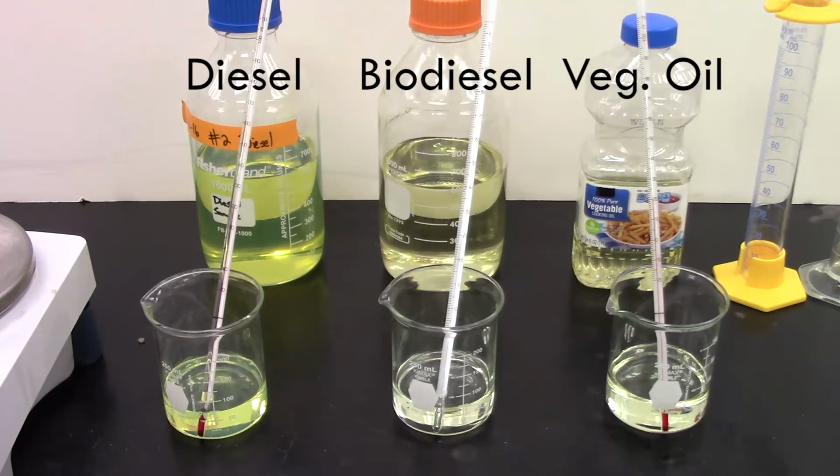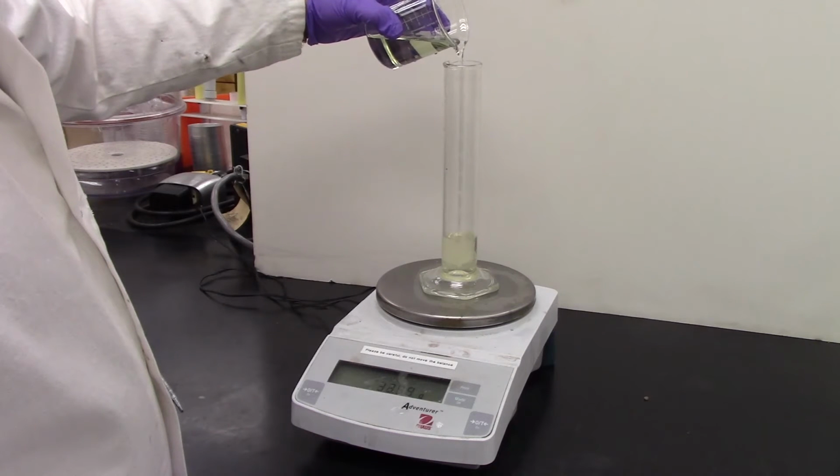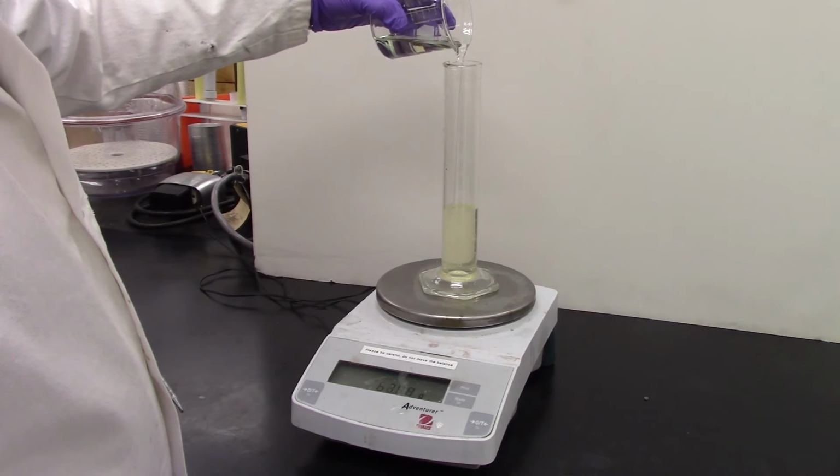Now, take the temperatures of soybean oil, biodiesel, and petroleum diesel and ensure that they are all at room temperature. If not, wait until they all come to room temperature. Pour the 100 grams of vegetable oil in a measuring cylinder using a dropper and a weighing scale.